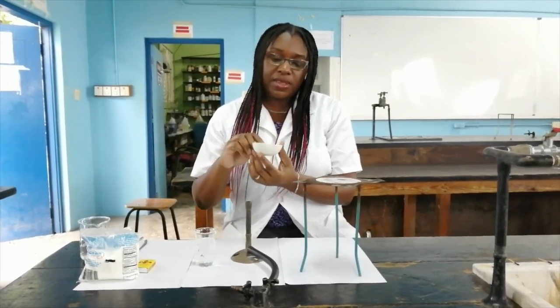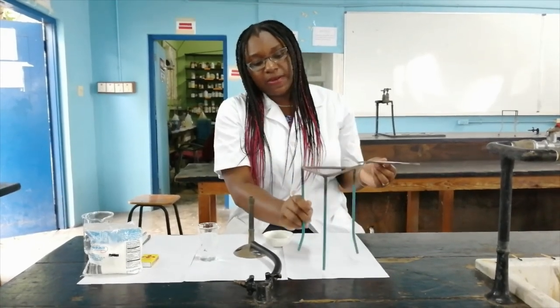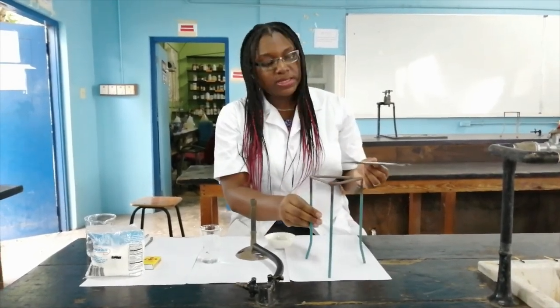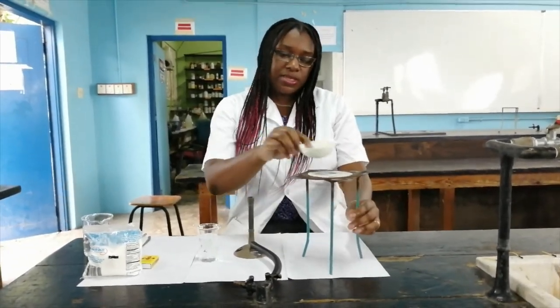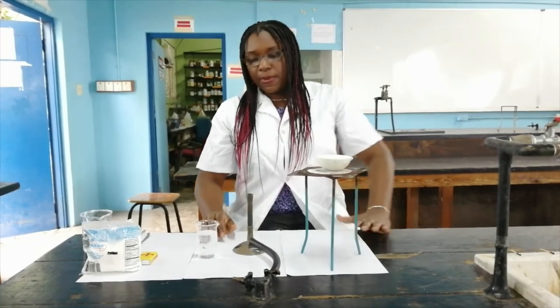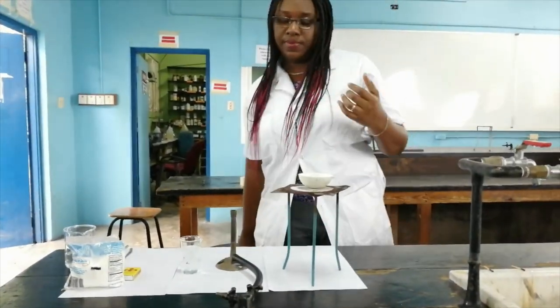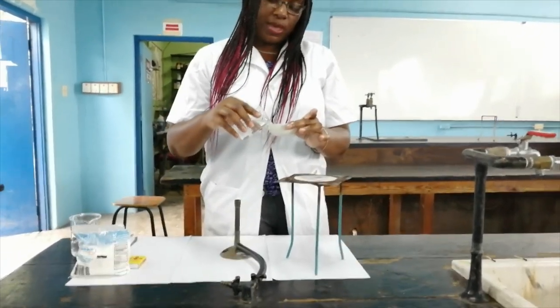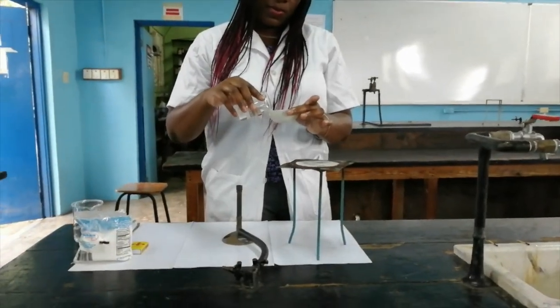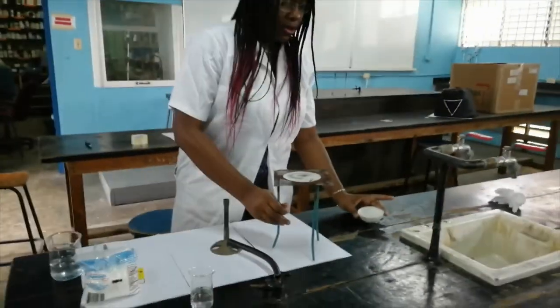This is also called an evaporating basin, and we have a tripod stand — three legs, hence a tripod stand — and we have a wire gauze. We're going to set up the apparatus, but before we do that we can simply pour the solution into the evaporating basin right now, and then we light the Bunsen burner.